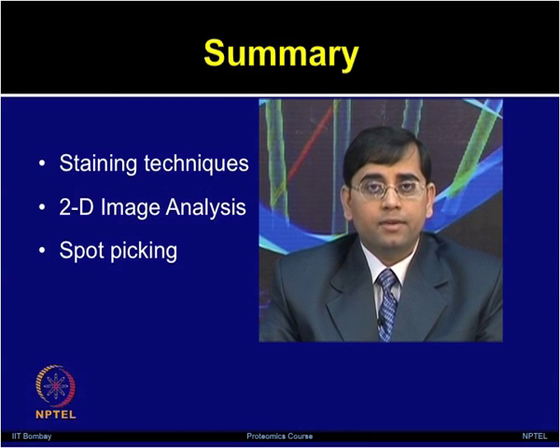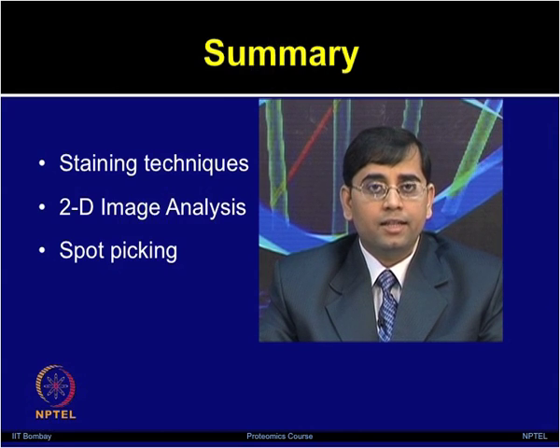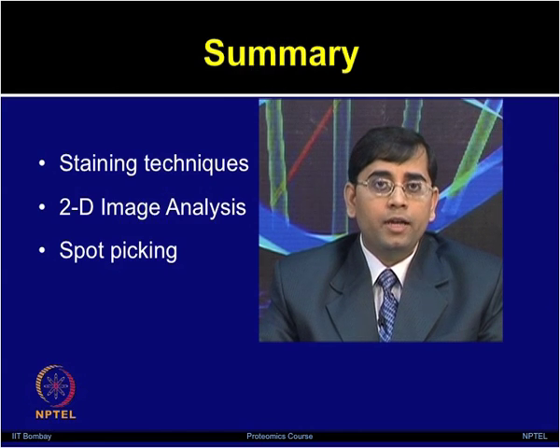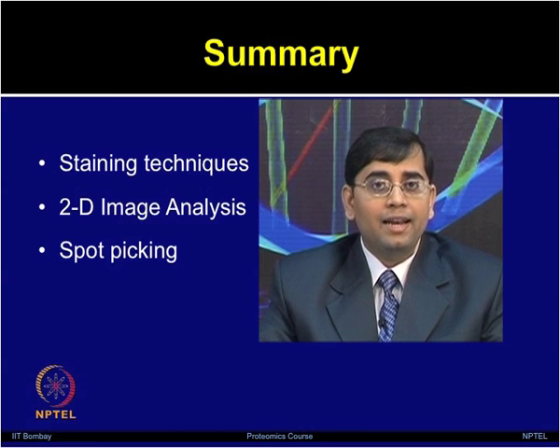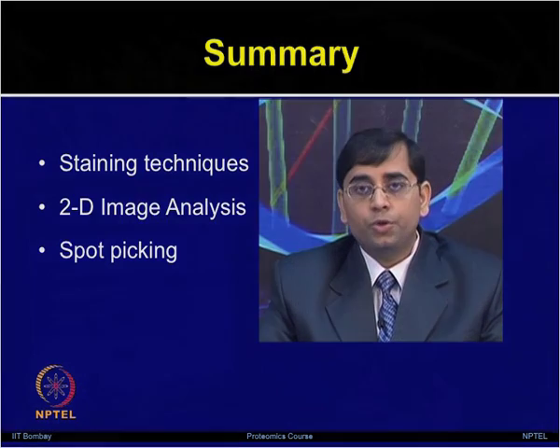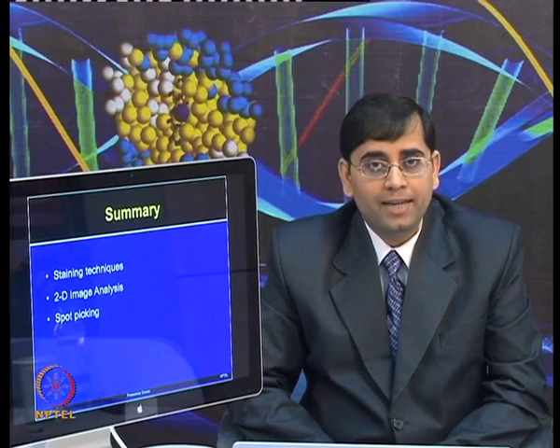We will continue this in the next lecture with a more advanced form of electrophoresis such as two-dimensional difference gel electrophoresis. I hope you are able to appreciate the various types of methods available to analyze protein samples or the complex proteome, and how one can, depending upon their challenging samples, apply different types of techniques. So, we will continue in the next lecture. I hope you are able to appreciate gel based proteomics and its potential. So, we will talk about 2D DIGE in the next lecture.